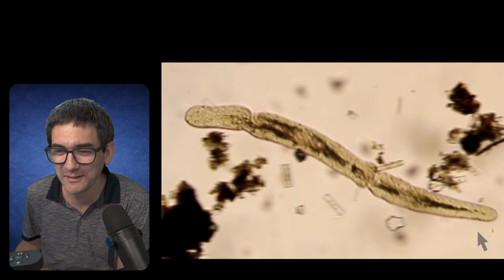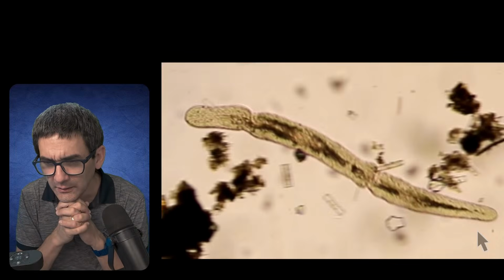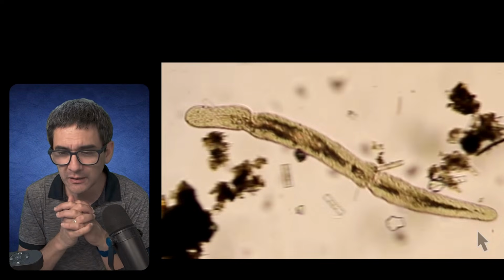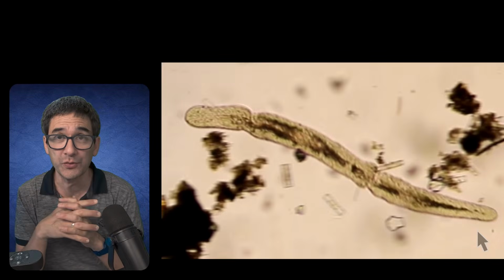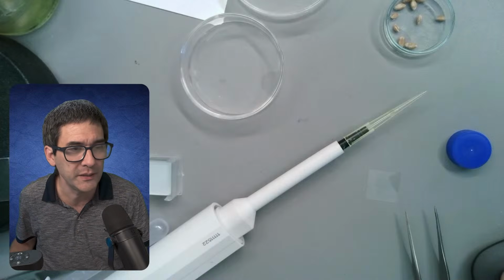Would you re-show us your favorite slide? I'd have to. You know what? I'll do the following. Marie Chardon asks me, would you re-show us your favorite slide? I'd have to grab them, but you know what I'll do is I'll write this down and maybe make a collection of my favorite permanently mounted microscope slides, and then I'll show them to you next week. How's that? Okay, so let's move on.